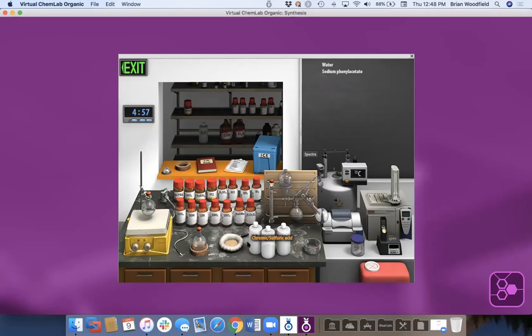So we would put some, I would say, natural pedagogical constraints to make it a solvable problem for us. One of those constraints would be these aqueous reagents, putting them on the heat here. We don't allow that. These guys are only turned on when you have the sep funnel. But if you want to explore what these do under heat and under different conditions, then go to the inorganic lab and do it there, because we have it all there. So this applies to the inorganic and the qual stuff, the same type of permutation things that you thought through. Yes.